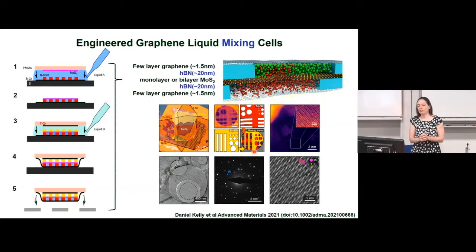It is something that originally took 3 months and now, once you've got the layers made, takes a couple of hours. So there's been a huge amount of work trying to develop this to make it happen much more quickly than it used to and much more reliably. We've gone from 1 in 10 working to 9 out of 10 working.